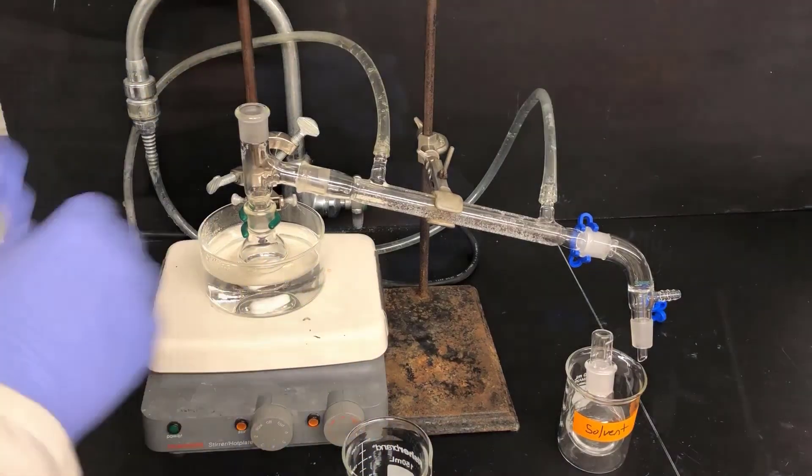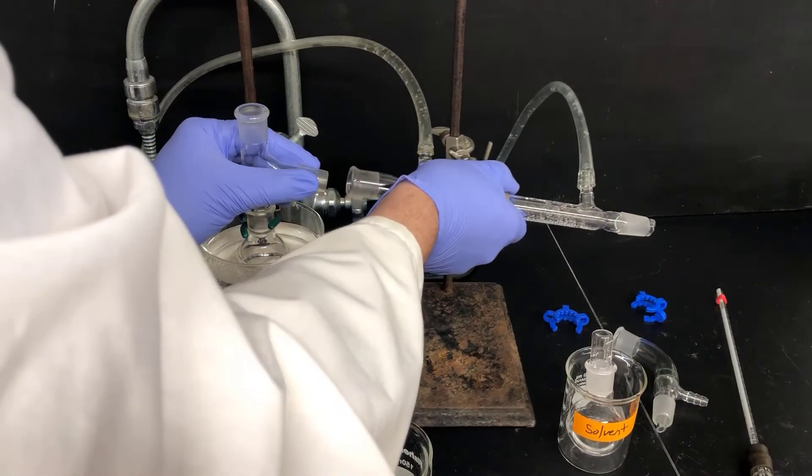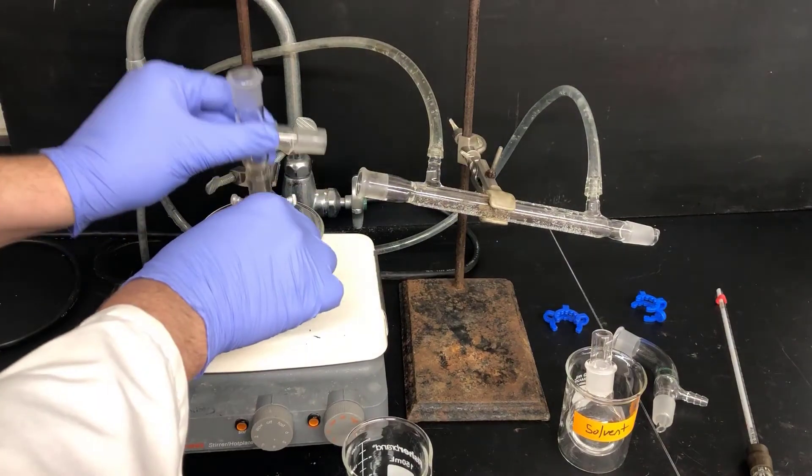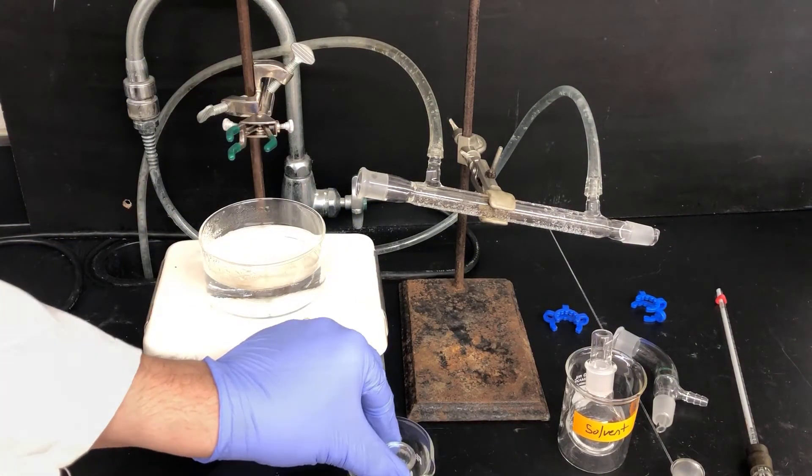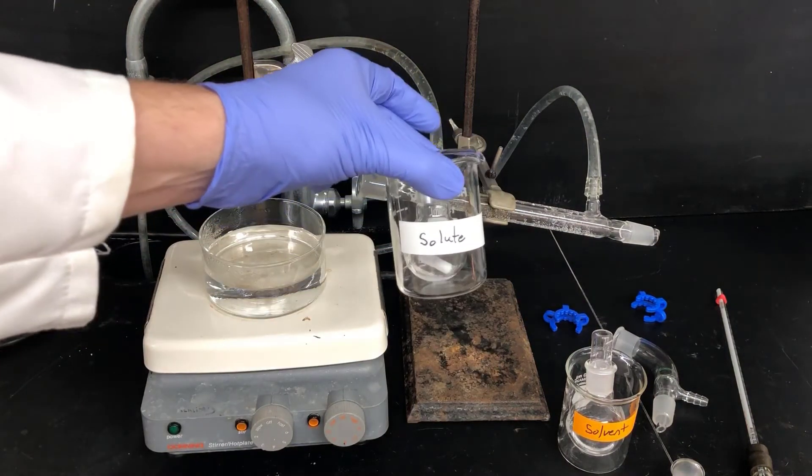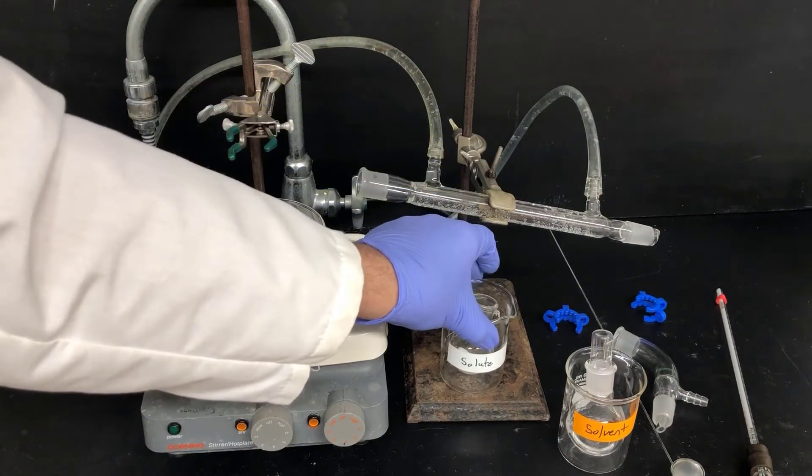Then I'll disassemble the distillation apparatus to get to the distillation flask, which contains a residue of unknown solute. And then I'll put that in a beaker labeled solute. This flask contains mainly the unknown solute, but there's still going to be a little bit of residual solvent that's left inside there.